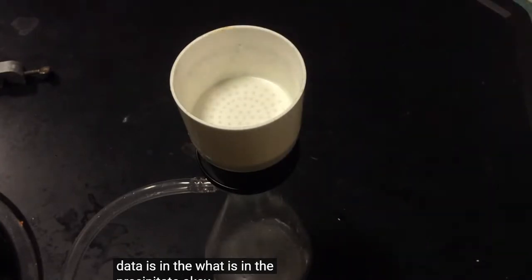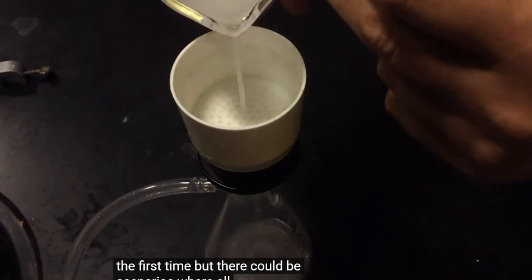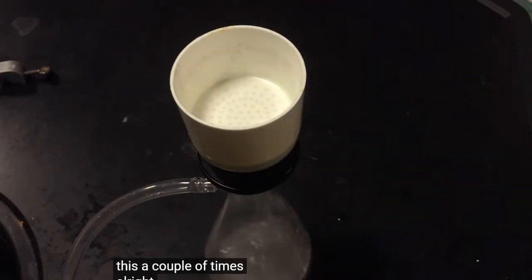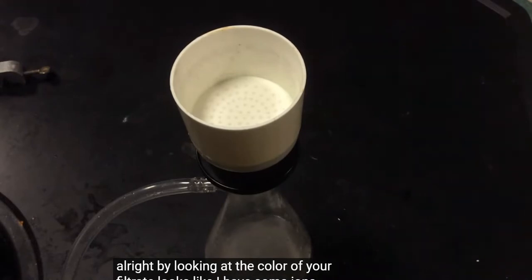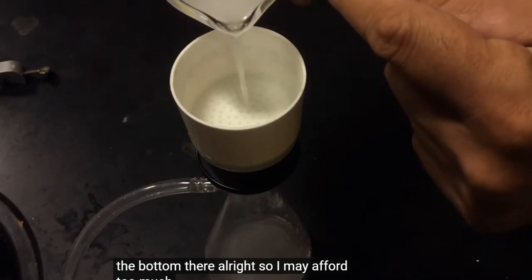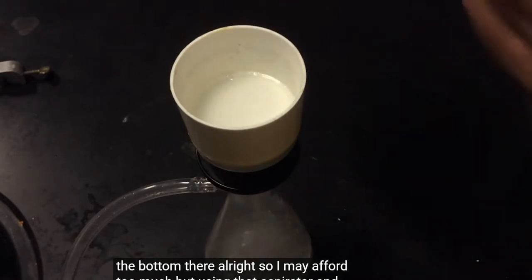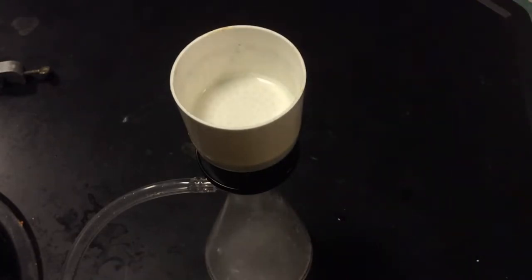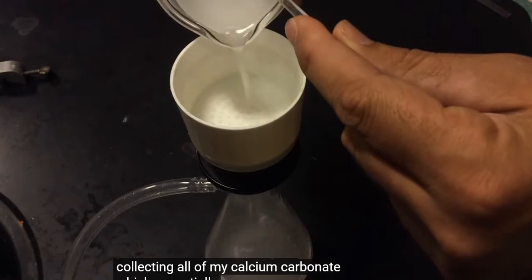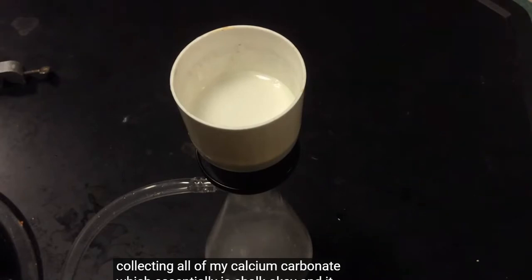Okay, now we may have a nice scenario where we're filtering nicely the first time, but there can be scenarios where you may need to do this a couple of times. By looking at the color of the filtrate, I have some at the bottom there, so I may have poured too much. But using that aspirator and the partial vacuum I'm creating, I'm collecting all of my calcium carbonate, which essentially is chalk. And it looks a little cloudy, so I'll probably do this a couple of times.